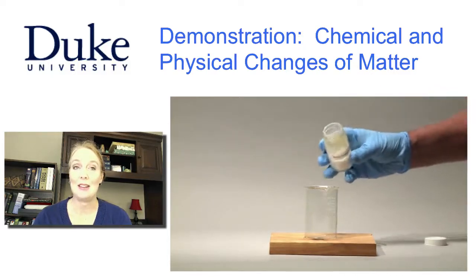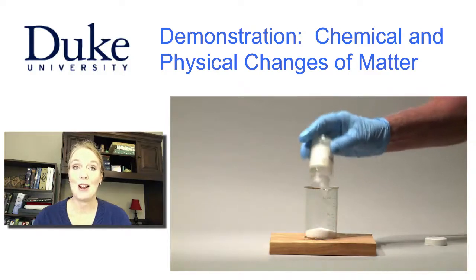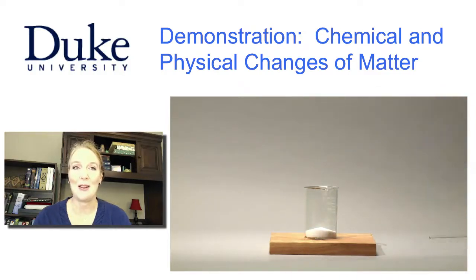Now he's adding a substance called barium hydroxide to the beaker. Barium hydroxide is a base, and you might not have heard of barium hydroxide, but you probably have heard of acids and bases. You can see that it's a solid, a nice white powder.